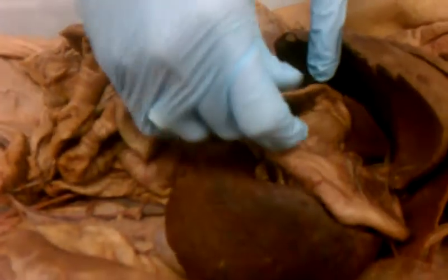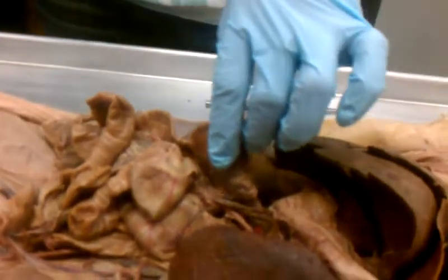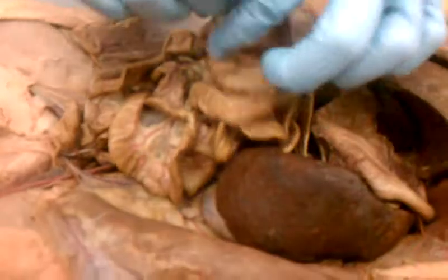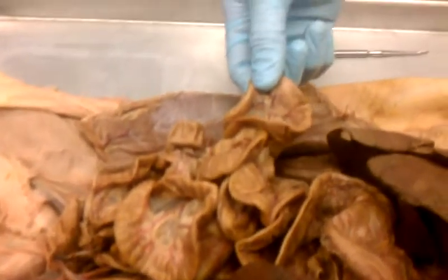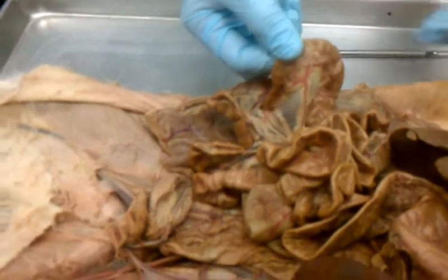The next part that's not on your sheet is called the jejunum. J-E-J-U-N-U-M. So that's the middle portion of the small intestine. So if you follow these around, probably right around here is the jejunum. It's the middle portion of the small intestine. Then if you keep going, you get the ileum, which is the bottom portion. The last portion of the small intestine.